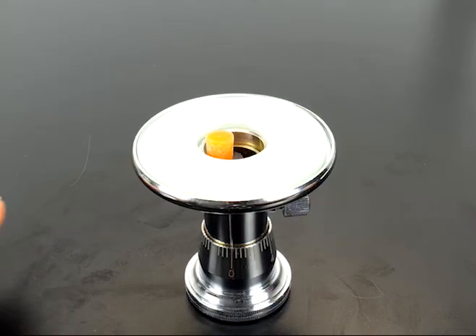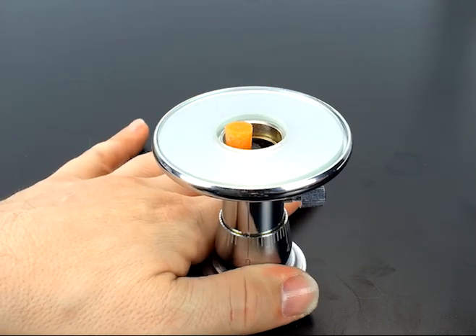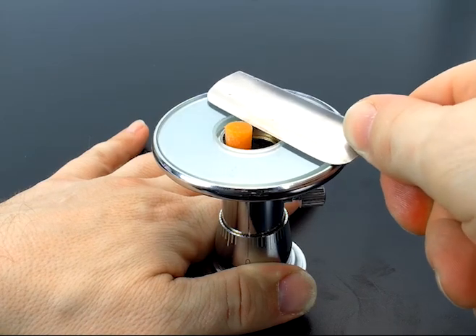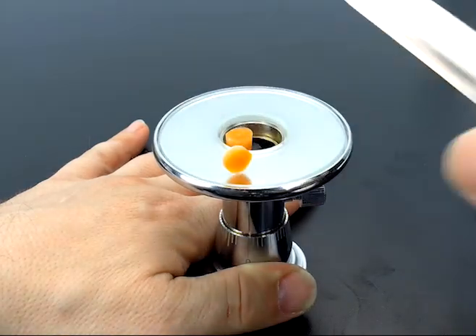Now that you have your sample mounted, you want to create a baseline. Hold the microtome firmly with one hand, and then slowly, in parallel with the glass plate on top, cut level to create your baseline.